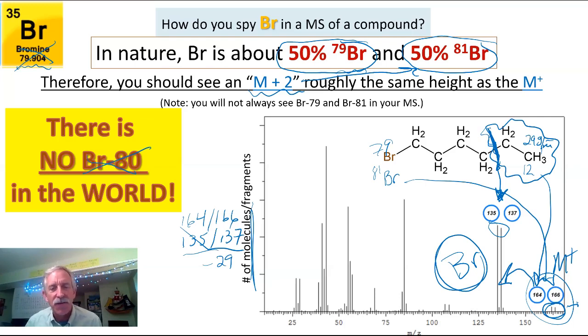CH2CH3 fell off. Granted, this is just bonus info for us. It's okay if you don't actually see this or use this data. But when trying to figure out a mystery compound, we like as much data as possible to confirm our final structure. So this might be helpful.